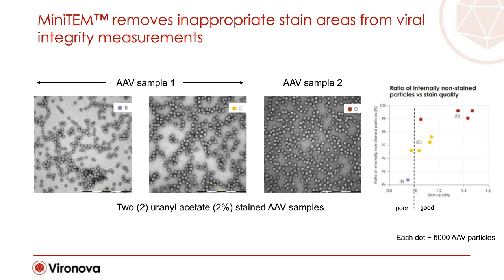Whilst in the right image, we have a much longer gradient of salt moving out from the particle, and we're measuring this type of curvature outside the particle, and with that we can assess if the embedding is okay or not.